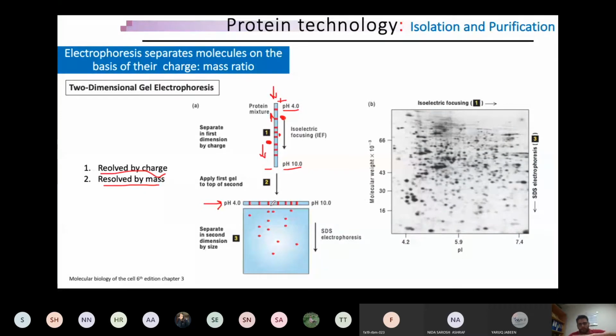It's just the layering. So you have a gel something like this, and you layer that on the top of that gel. Of course, this pencil is in fact a bit bigger, so this gel will be of the same size as this wire. So what will happen?